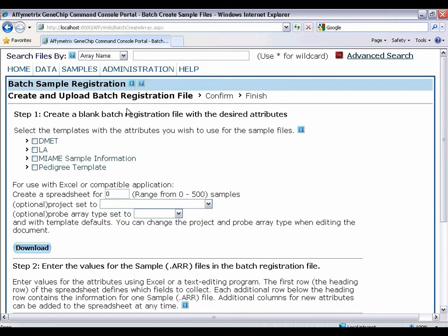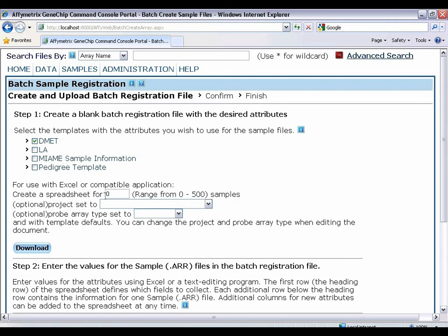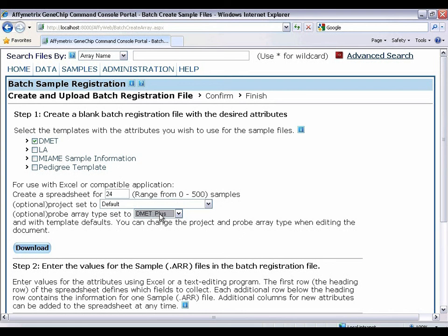So we will associate the DMET template to add the required sample attributes. What I'm going to do is I'm going to create a spreadsheet for 24 chips. And where should I save the data? I'm going to save it to the default folder. And since I'm working with DMET plus arrays, I'll select the DMET plus probe array type. Then I'll download the Excel template.